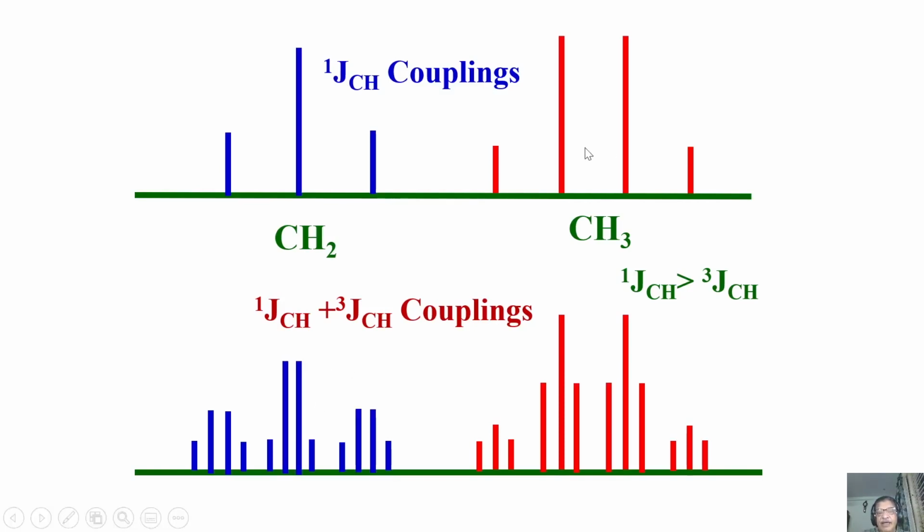Similarly, here also, the carbon directly bonded to 3 protons will be a quartet. It is only a stick plot I am giving you to make you understand. A carbon directly bonded to protons will give rise to a quartet. But there is also a remotely bonded proton to this carbon. What will happen? Then each line of the quartet is going to be a triplet.